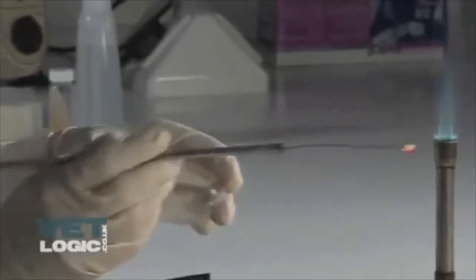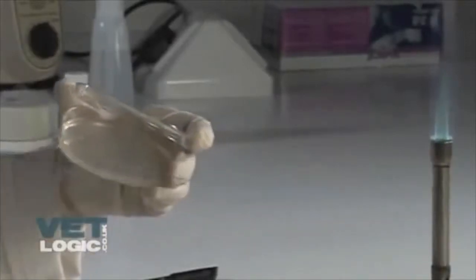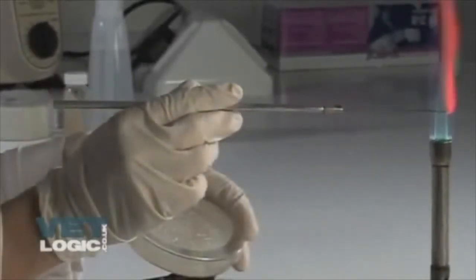Heat the loop again and make a fourth well by drawing bacteria once from the third well. Heat the loop again.